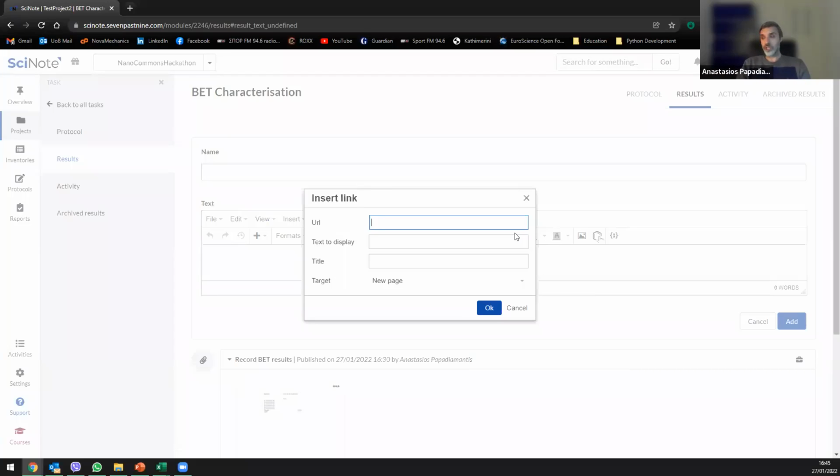I have not really tried it with files or folders on network drives. But assuming that you are linked within the same network, I assume it would be possible because usually Office allows that. So it's probably doable, but we need to test it, to be honest. We'll test it and then come back to you.